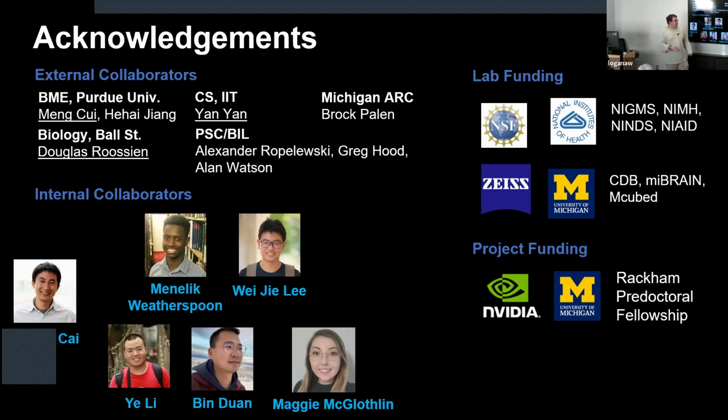Now, something that the lab has been working on is combining the sample tissue preparation methods with microscopy and some of these RNA probing based approaches, which, I don't know if that falls into the category of transcriptomics, if it's just RNA staining, but you know. So some of those methods with optimized protocols could be applicable, because as long as your probes can diffuse in the right amount of time and so forth, you could combine it with that.